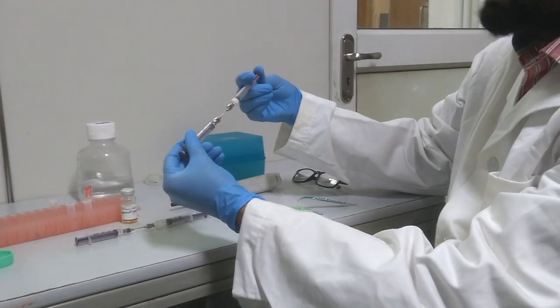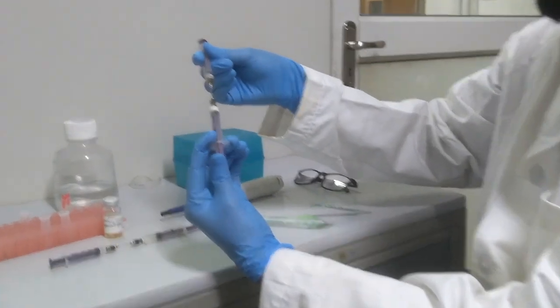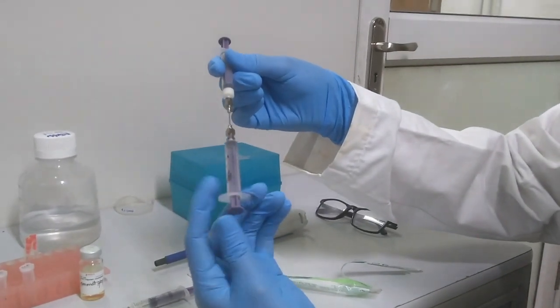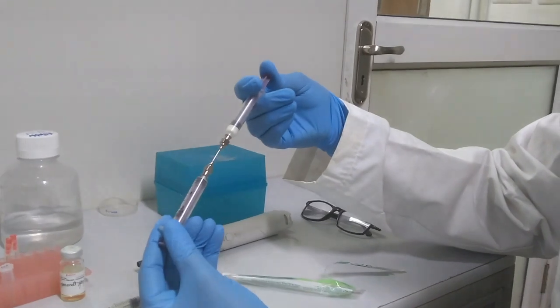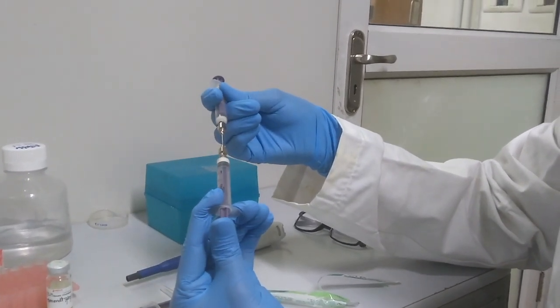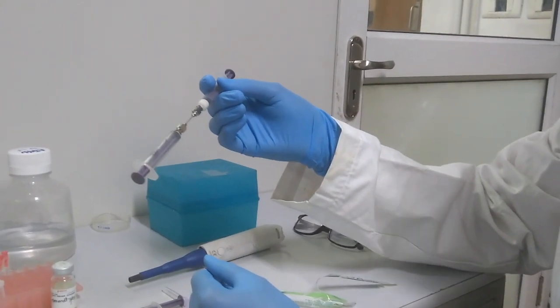Now you can push this emulsion from one syringe to another syringe through the needle. This process creates a very good emulsion, which doesn't separate out later on when you are ready to inject.